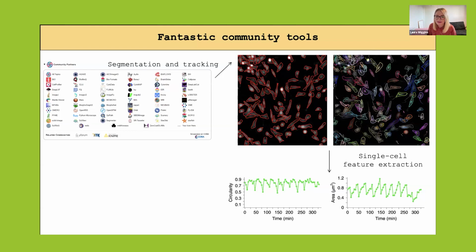The problem with that is that we have these time series, but we're not quite sure what to do with them. What metrics do we need to look at for single features, and how do we actually combine them? So how can we say one cell type changes in circularity and it also does this in area whilst doing this in volume, and kind of merging all of that together? And that was our starting point.